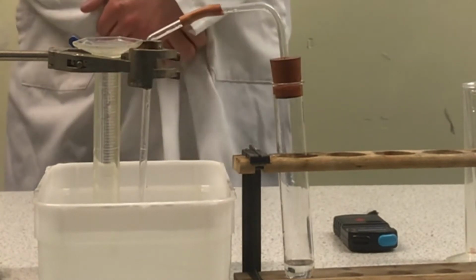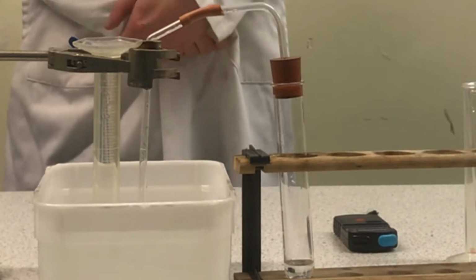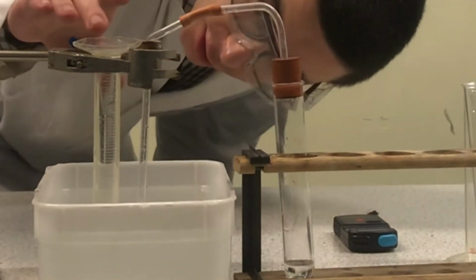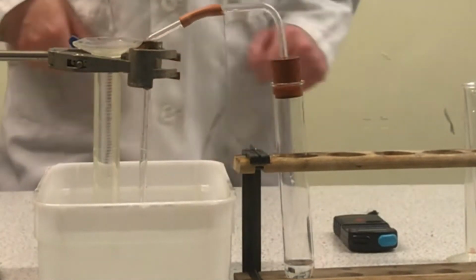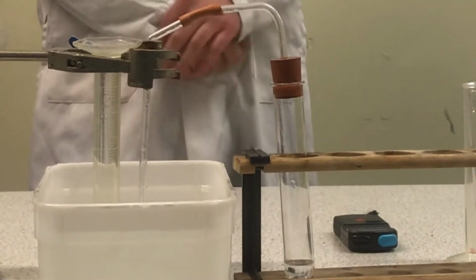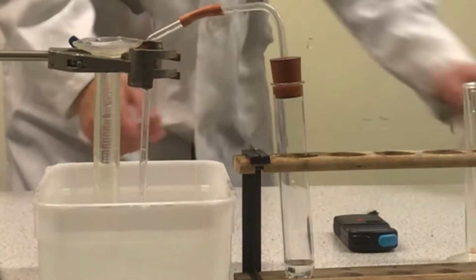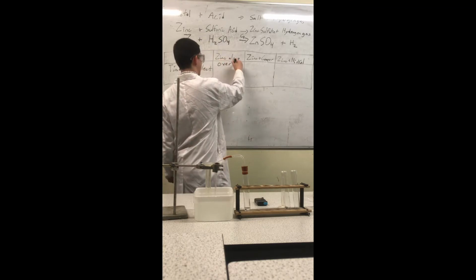Now this is producing gas at such a slow rate, it will probably take 30 minutes to produce 10 centimeter cubed of gas, as right now there's only very, very small bubbles of gas that are being produced. Now, just so this video doesn't take over an hour, I will end this test here, and it will probably take over 30 minutes.